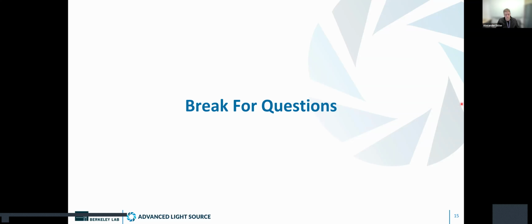And so this is something we can certainly do, but I think the best we've gotten is probably around 5 nanometers. We have a paper which claims that, but we often have discussions about what that actually means. Can you actually resolve features at that length scale or not? So the standard definition is a little bit suspect as well. But we're hoping to get down, but possibly not that low.